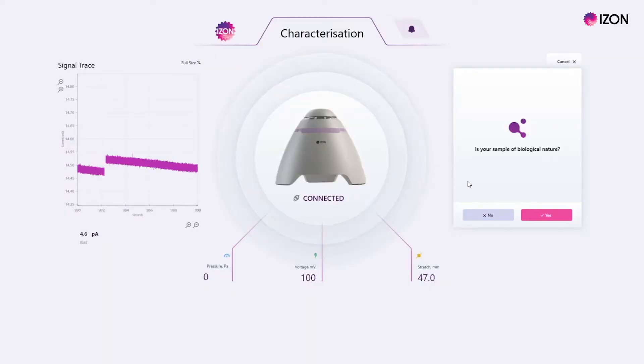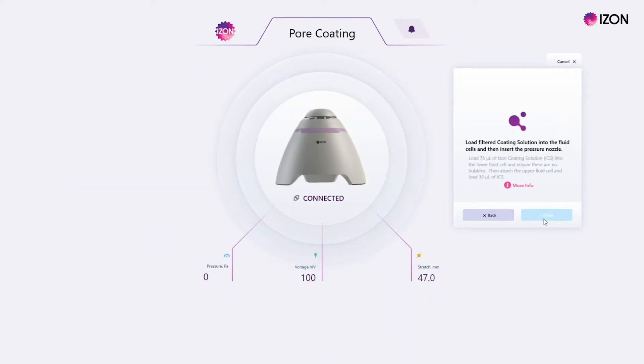The setup will now ask if you are measuring samples of a biological nature to determine if the coating sequence needs to be run. If you are not running a biological sample type, click no to move on.